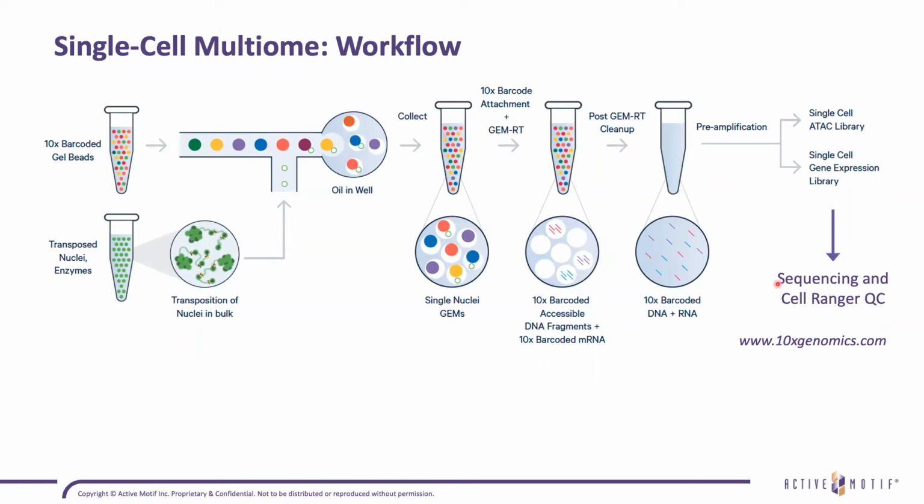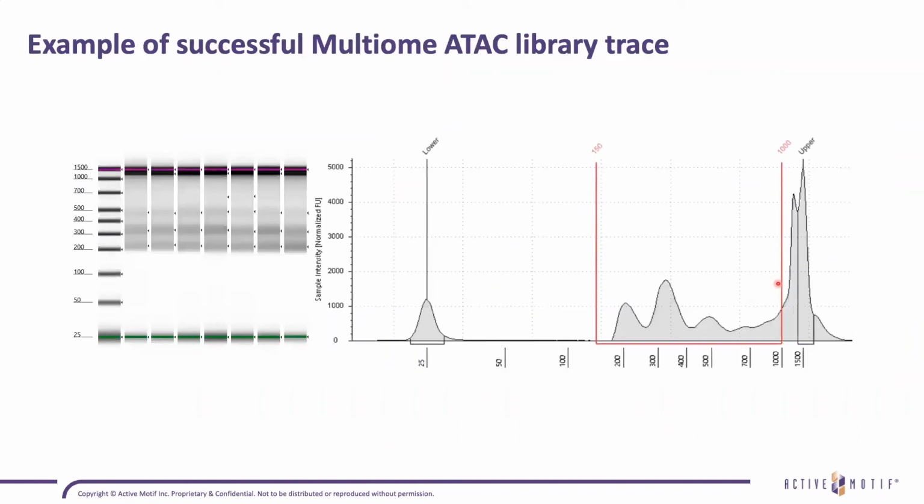Next, we'll look at some examples of successful libraries. So here's an example of a successful multiome ATAC library trace. We used a fragment analyzer called TapeStation to analyze the ATAC libraries here.